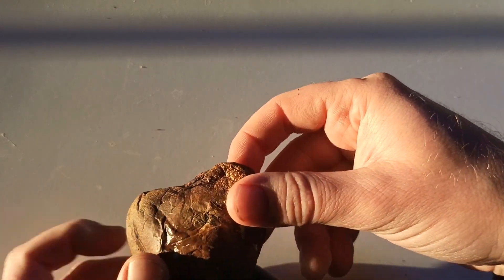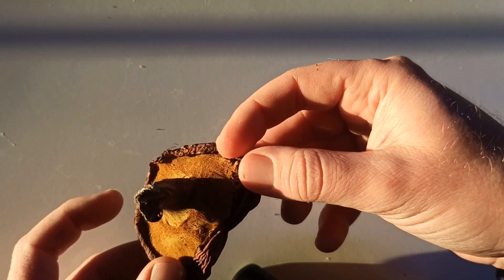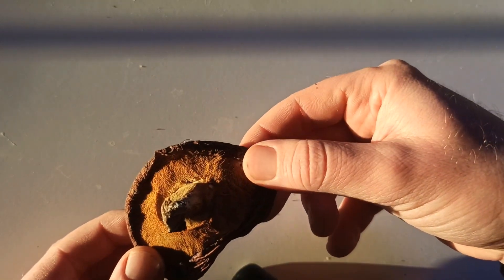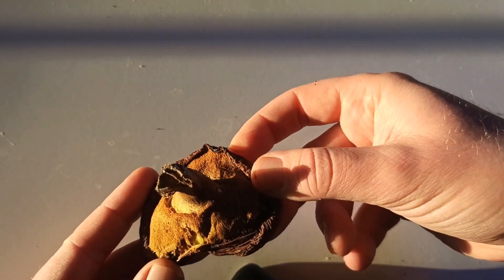This is the cap. It's so mucilaginous. And we're going to see it under the microscope and the loupe — we're going to see it two ways. Let's see what it has.